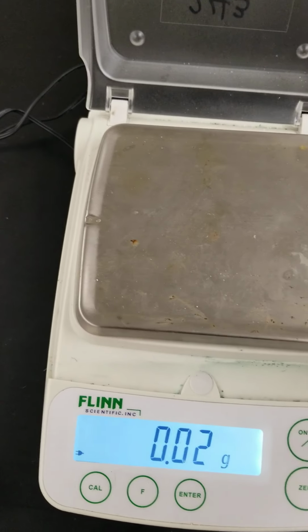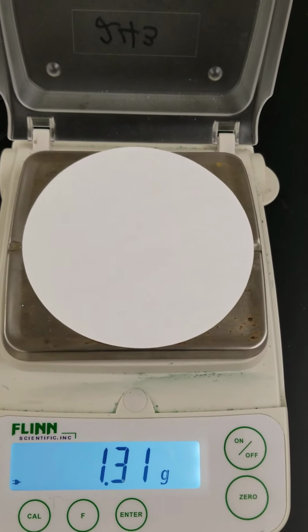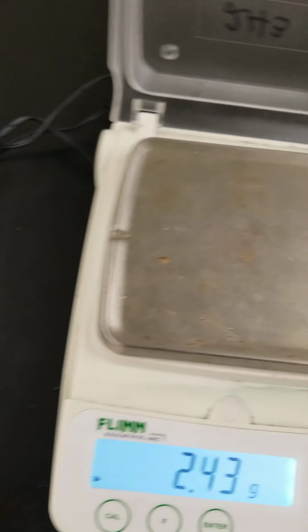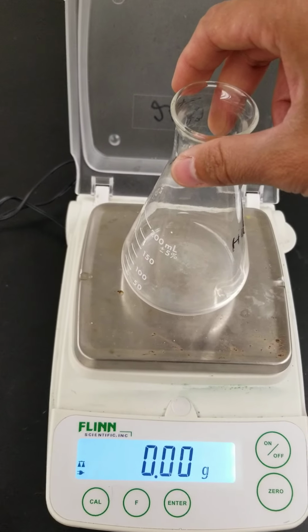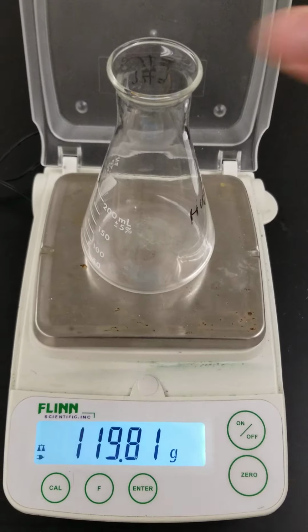We also need to record, let me make sure it's back to zero, our filter paper, 1.31. And so let me just move this slowly. The last one we have to record is our Erlenmeyer flask, and it weighs 119.81.